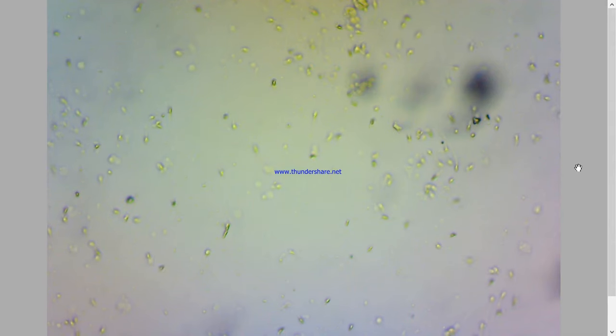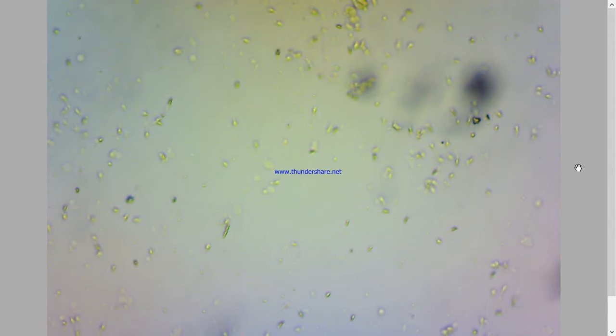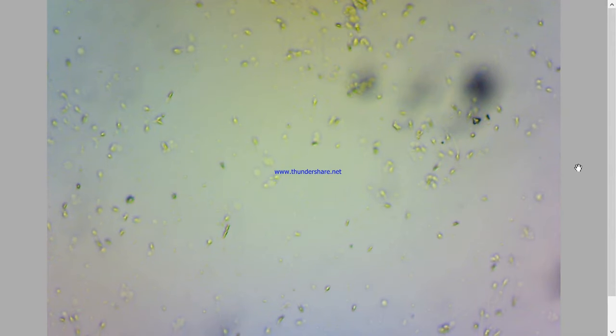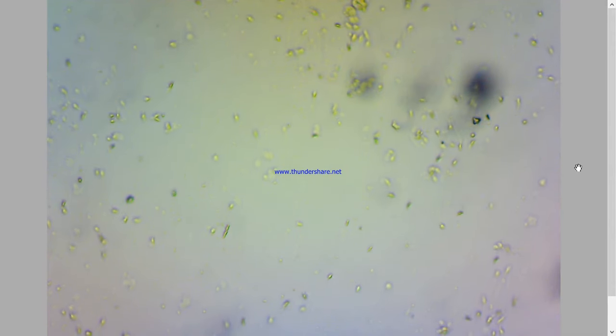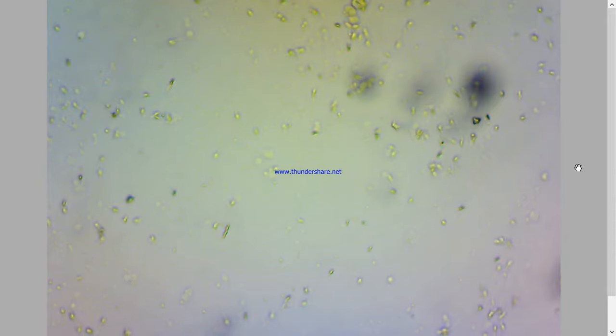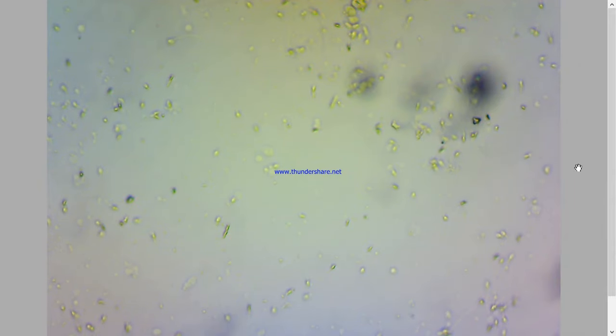In this video taken through the microscope, you can see sperm cells exhibiting different motility grades. Observe the individual sperms followed by the cursor.